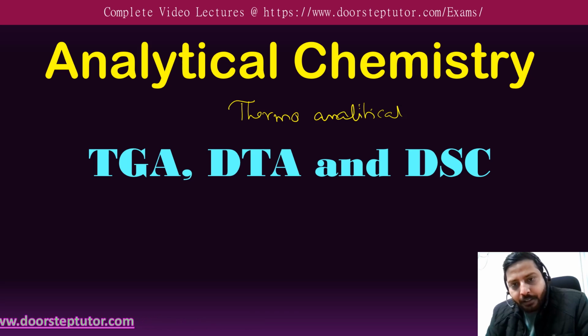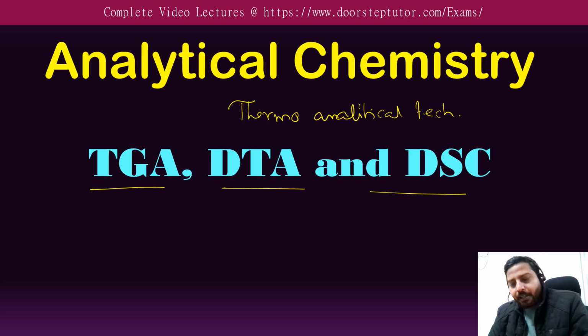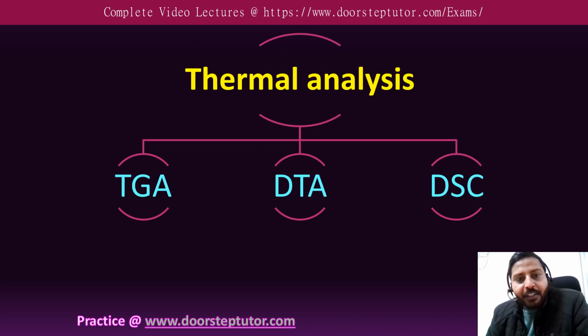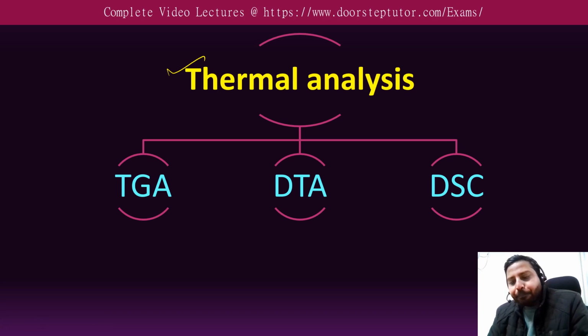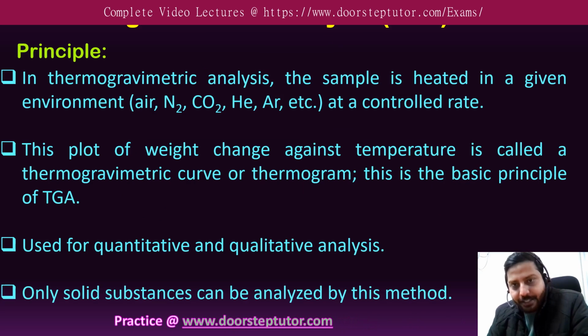This thermoanalytical technique contains TGA, DTA and DSC. This thermal analysis is divided into these three common parts: thermogravimetric analysis, DTA and DSC. So let's start with thermogravimetric analysis, that is TGA.